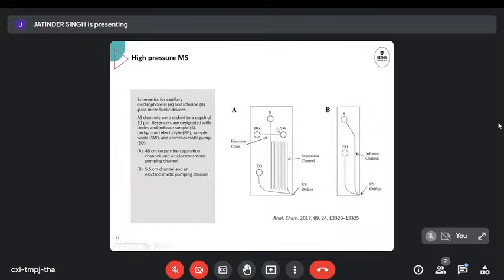We temporarily don't do anything with our power supplies. So we allow for the diffusion of analyte sitting at the intersection down into this channel. Then we apply the potential to our background reservoir, to our other electrodes, which is probably our grounded part here with the mass spectrometer. And we can get an electrophoretic separation in the separation channel here.